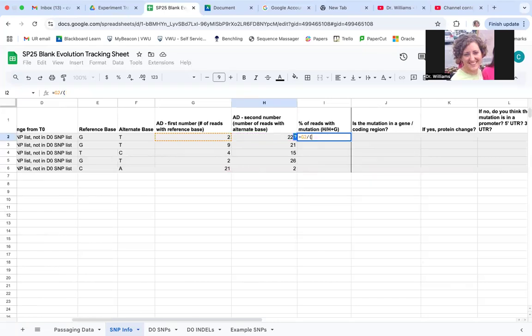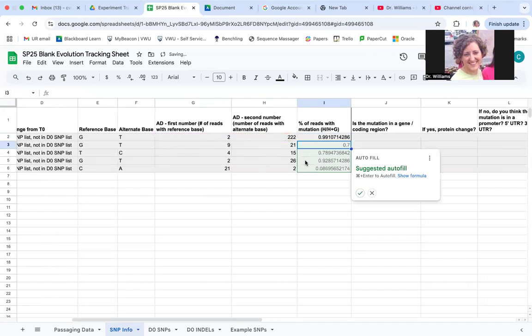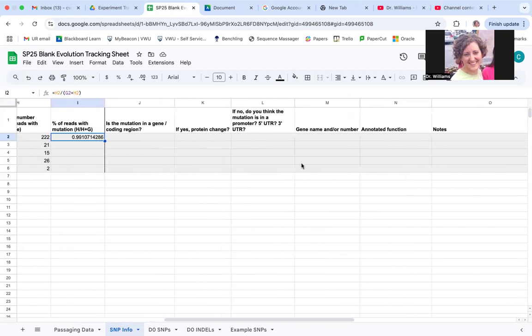Oh, wait. Y'all don't listen to me. I did that upside down. Mutation divided by total. I even wrote it for you right here in the formula. Follow the formula. And then look, it's going to be smart and be like, do you want to do all of them? You should, but I'm going to click no. All right. And it's looking like 99.1%, which fits with the numbers we're seeing, right? 222 reads with the alternate, only 2 with the reference. All right, moving on along.